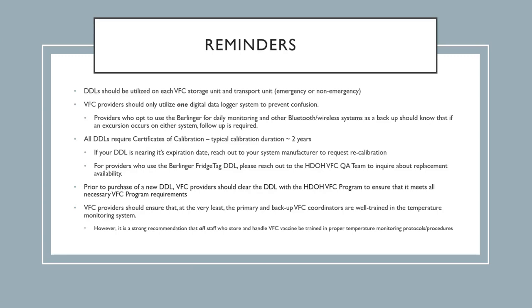Providers who opt to use the Berlinger for daily monitoring and other Bluetooth or wireless systems as a backup should know that if an excursion occurs on either system, a follow-up is going to be required regardless of whether or not an excursion showed up on one or the other.